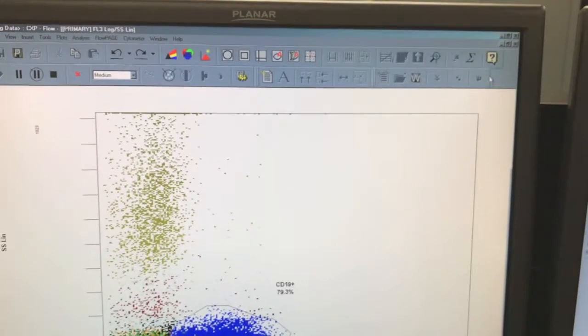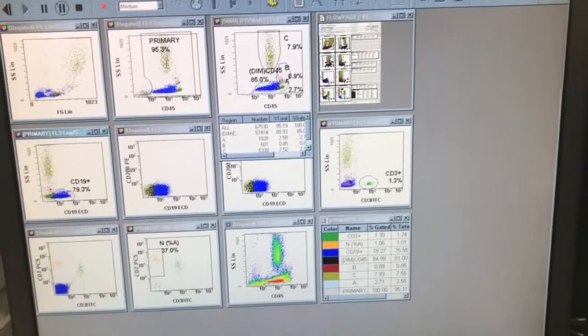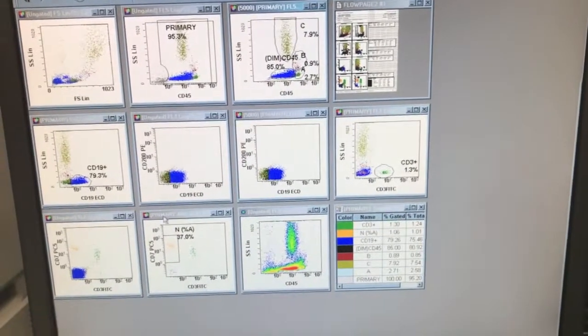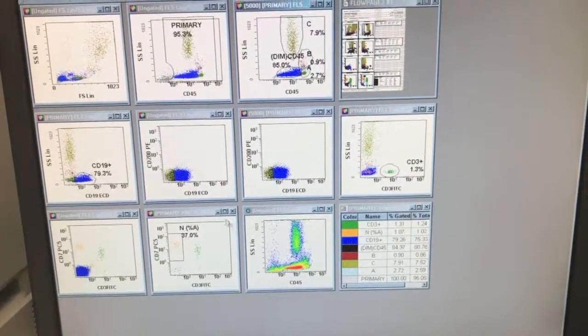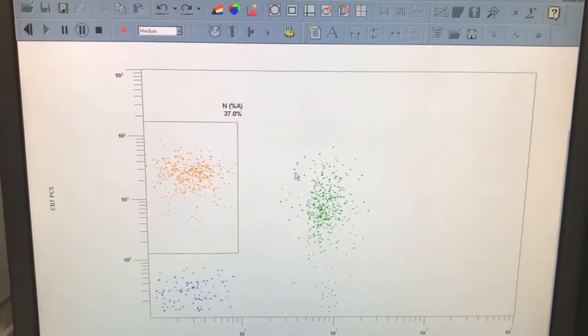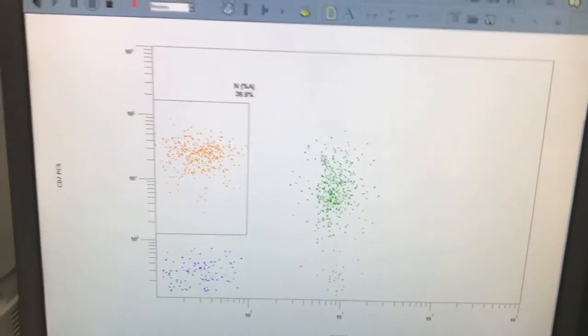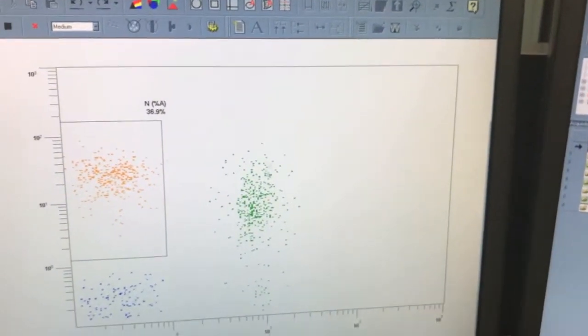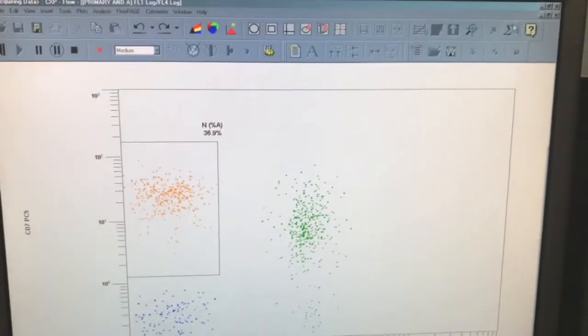So I'm just looking everything over, and we're going to check out the other histogram plots here. So we have our CD3 or CD19, and we see that CD19 is very positive, and it's mostly in the DIM population. Here's our CD7 versus CD3, and we're supposed to have a nice streak downwards. It's not too abnormal, but we know this patient already has something going on because of all the DIM45. So they're not going to have too many T cells. And that is it for tube number 1.